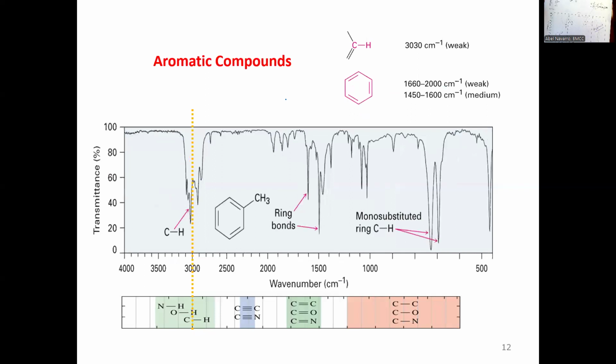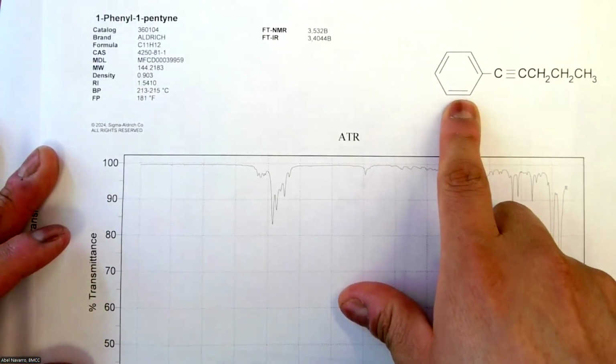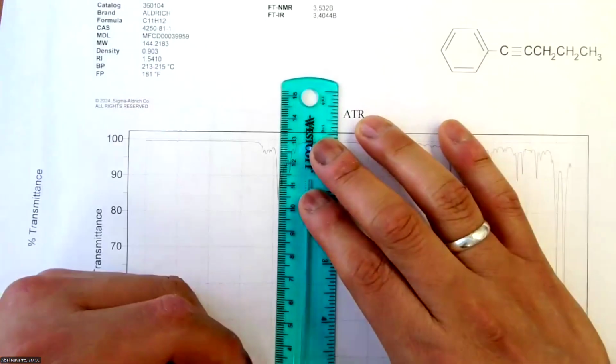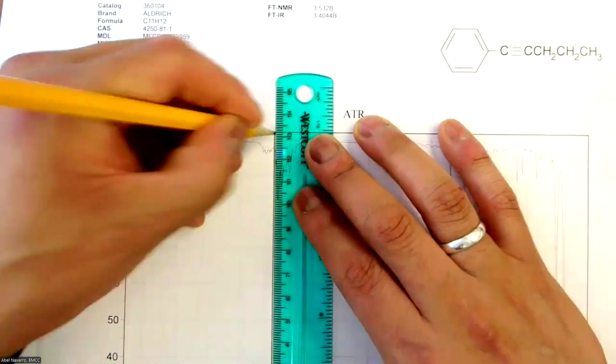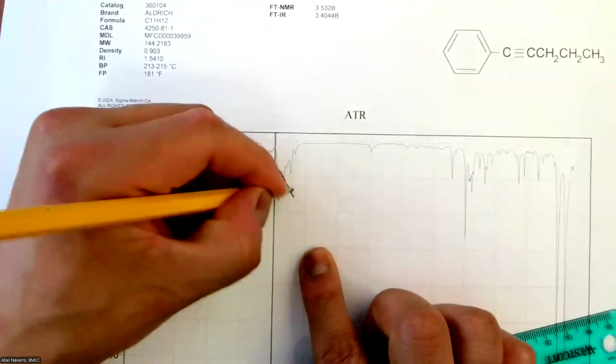I think we'll first, oh, the aromatic compounds. Aromatic compounds are also CH sp2. Let me see if I find an aromatic. Yeah, we have aromatic here. Aromatic compounds, right? This one is an aromatic compound. It's a benzene ring. So for aromatic compounds, let's do the same analysis. The 3000 line. Okay. There's a line right below 3000, CH sp3.